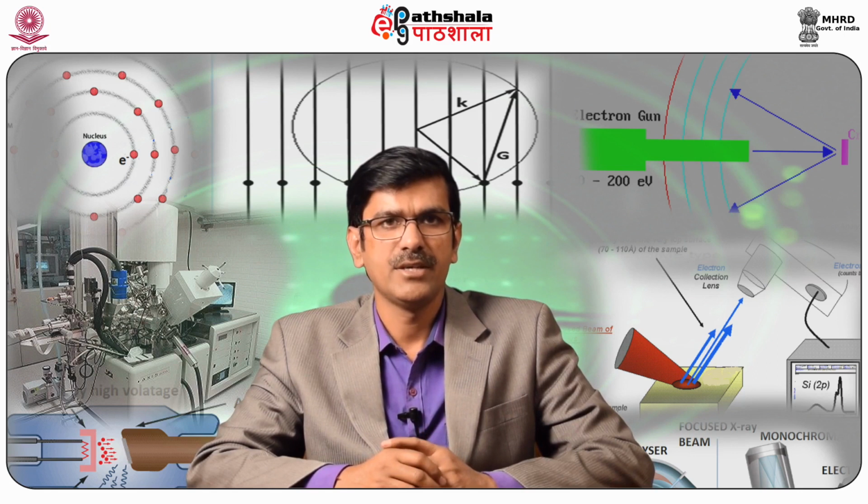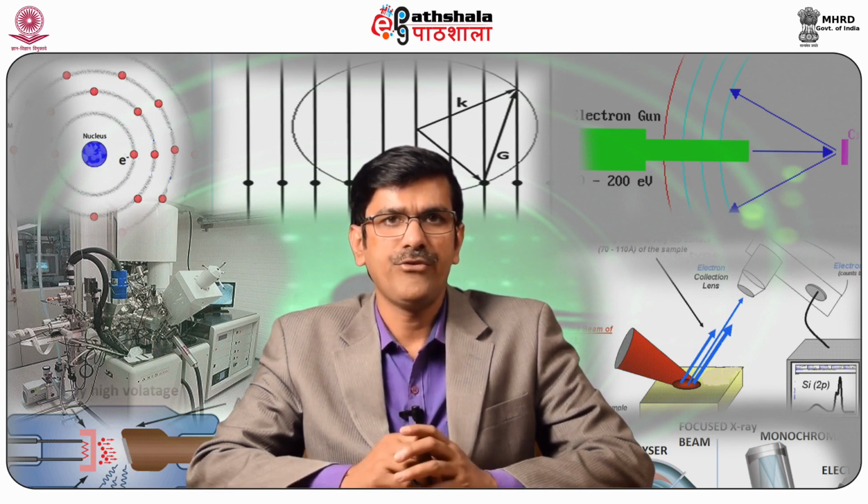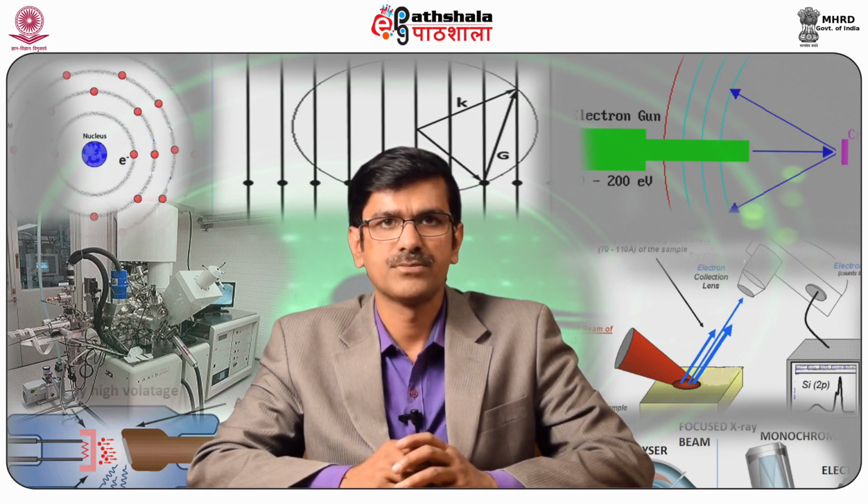The high brightness, as synchrotron has more than 3 orders of magnitude higher than conventional source, allows application of extremely high energy resolution that is precluded in conventional XPS because of the trade-off between resolution and transmission. The high photon flux also enhances photoelectron diffraction measurements.